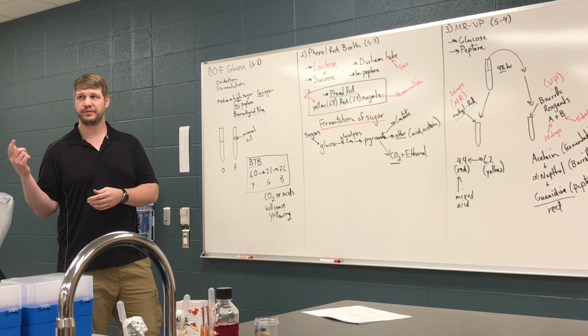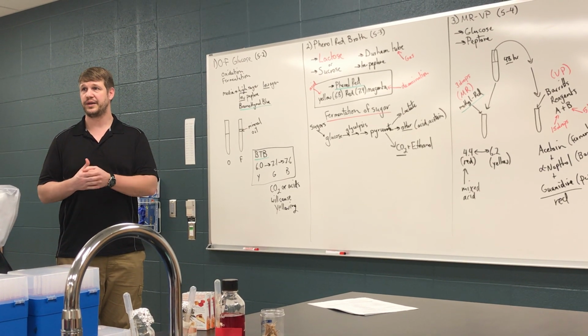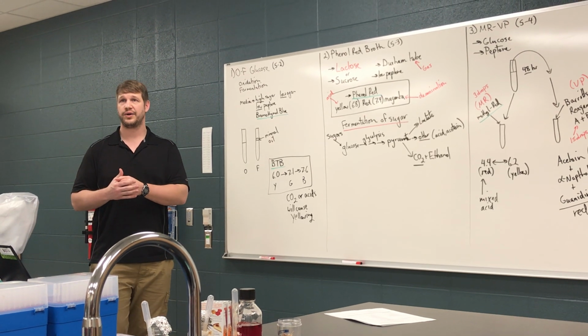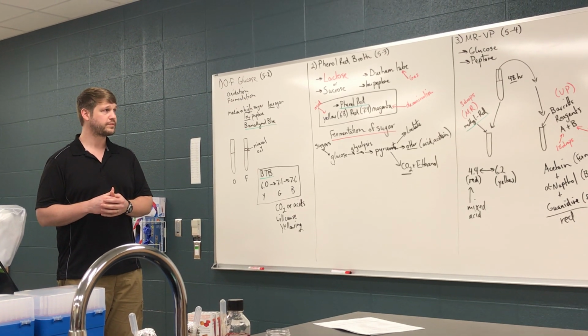That should be familiar. That idea was discussed when we talked about the sulfur-indole motility media. Utilization of cysteine or tryptophan could also lead to alkalinization, which would be, in theory, detectable.